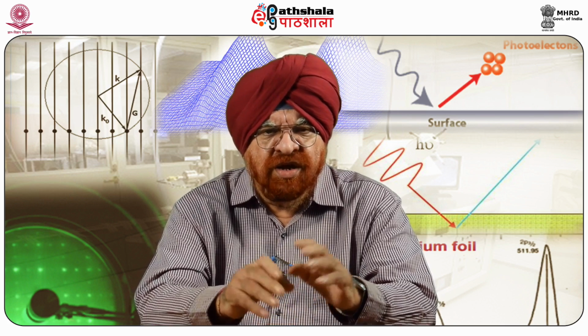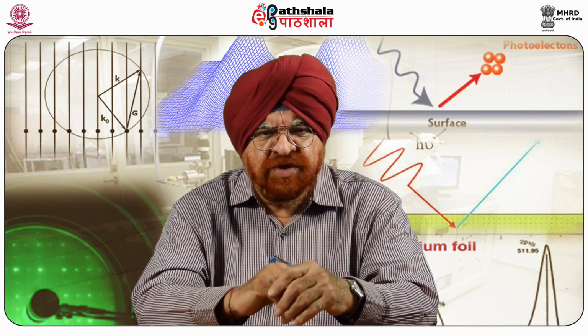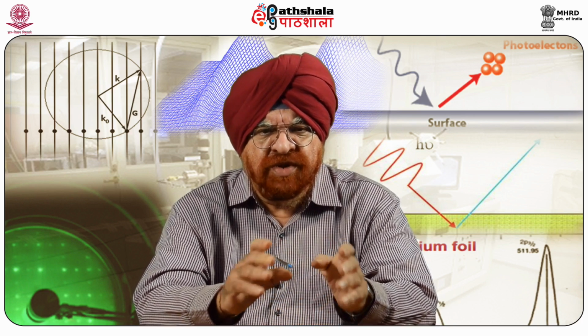The advantages of this MFM originate from several reasons, which include that the sample does not need to be electrically conductive, which is a major advantage. Measurements can be performed at ambient temperatures, in ultra high vacuum called UHV, in liquid environments also, at different temperatures as well, and of course in the presence of variable external magnetic fields.